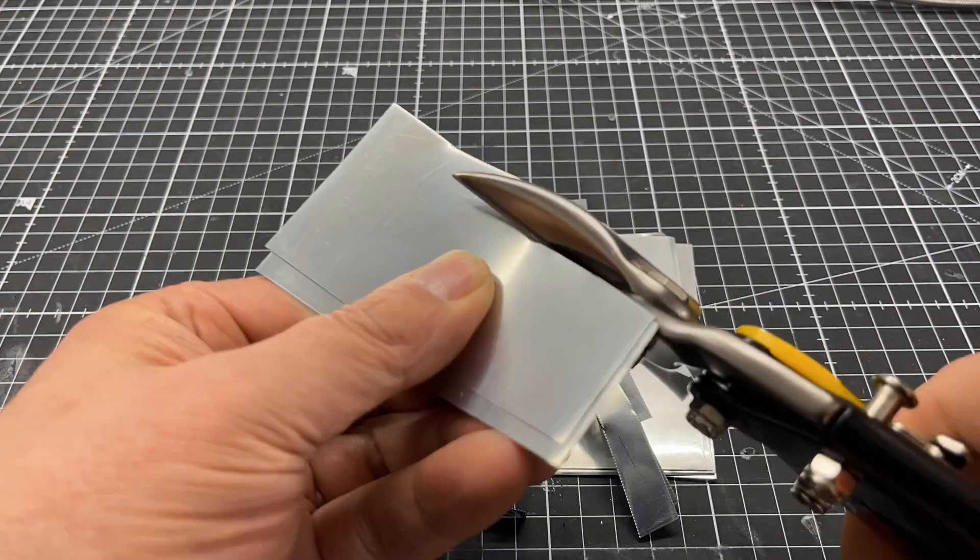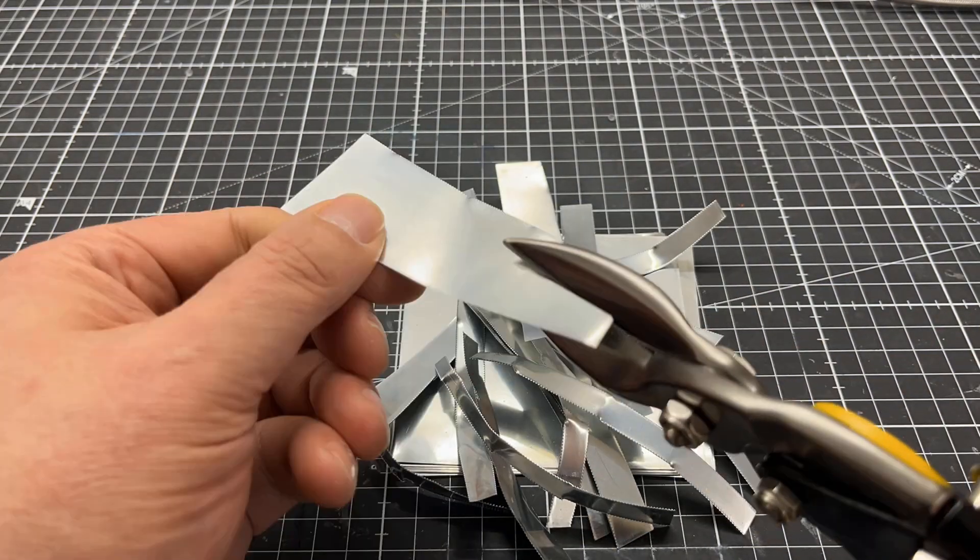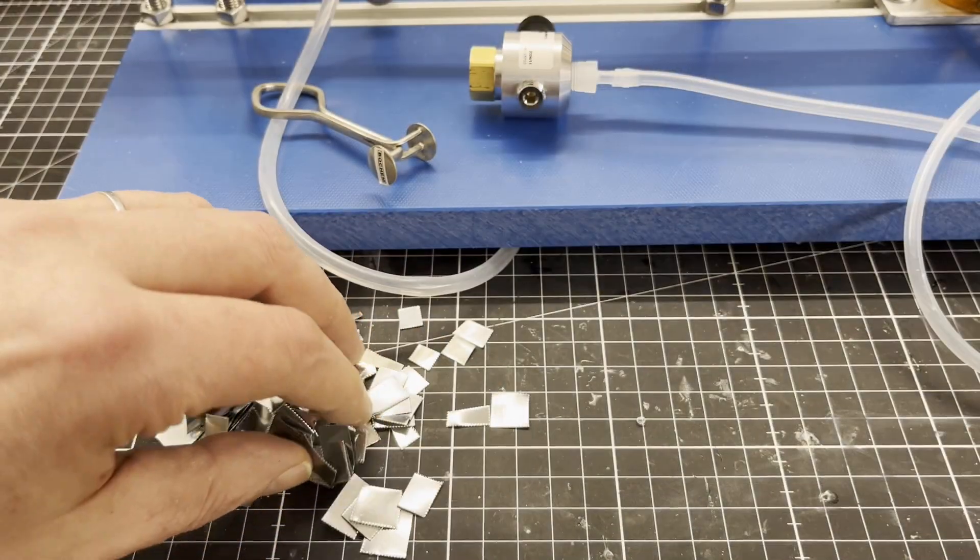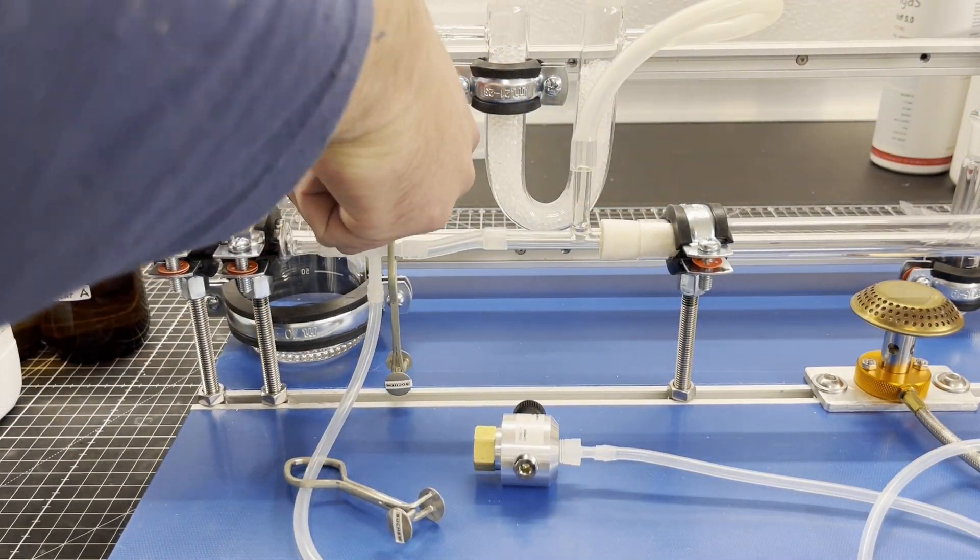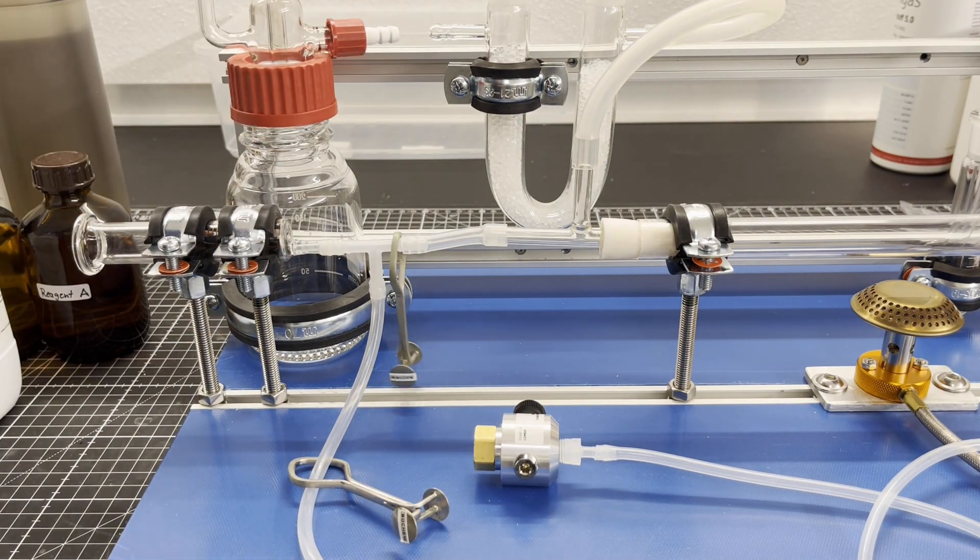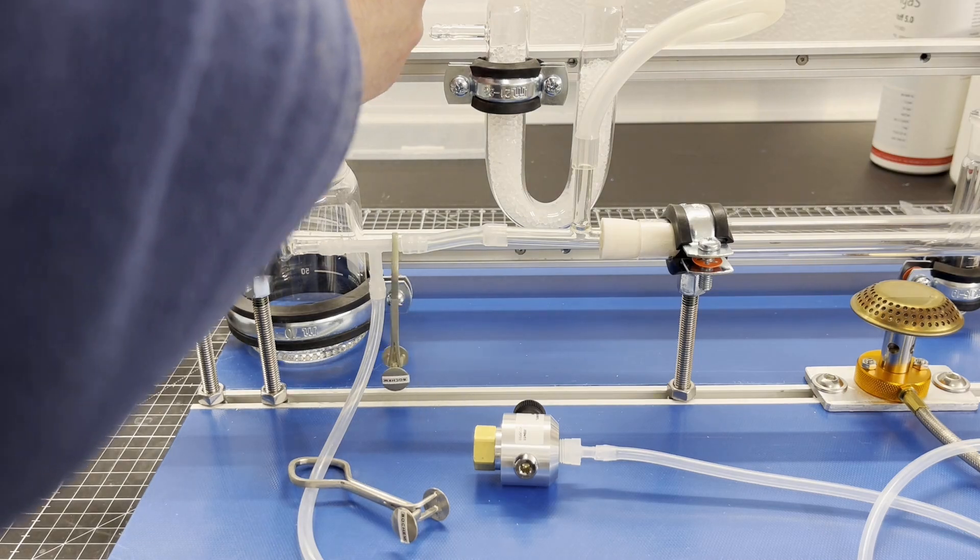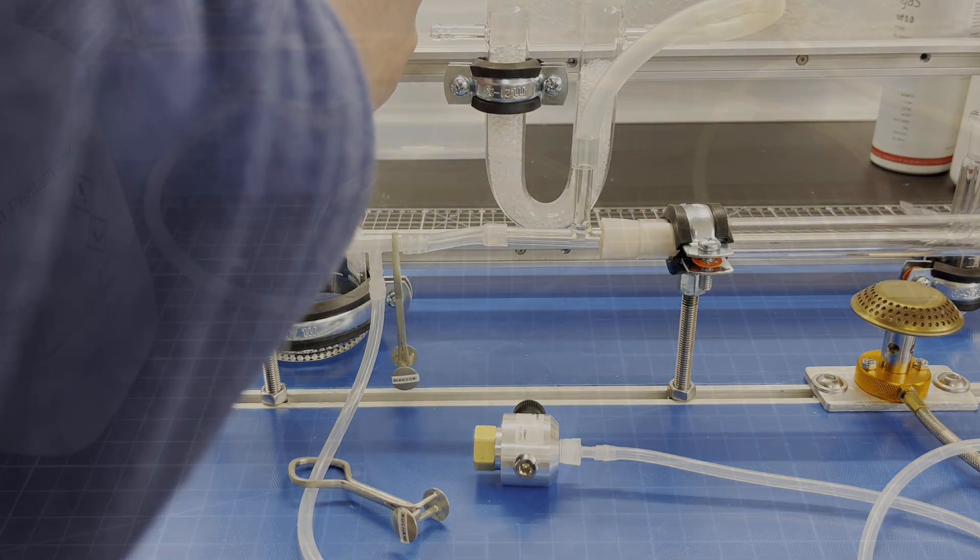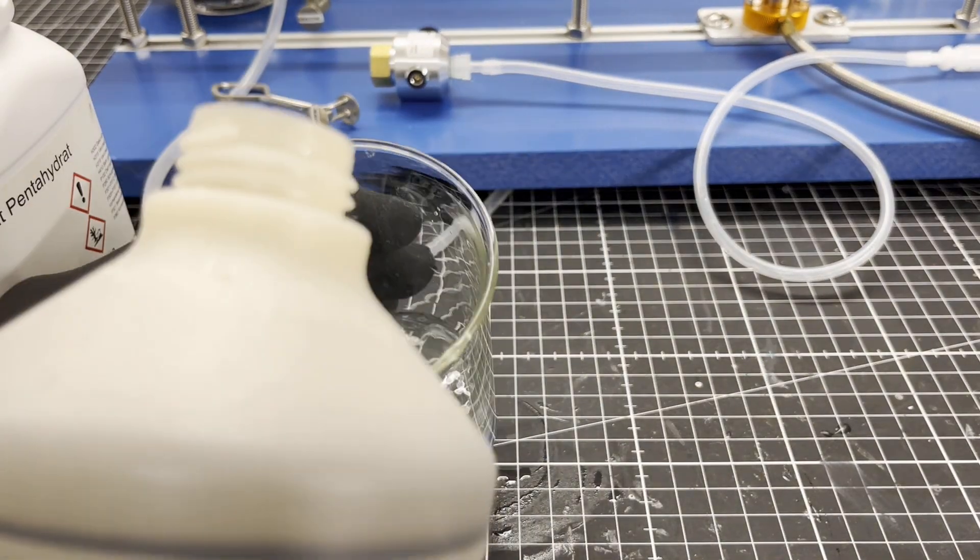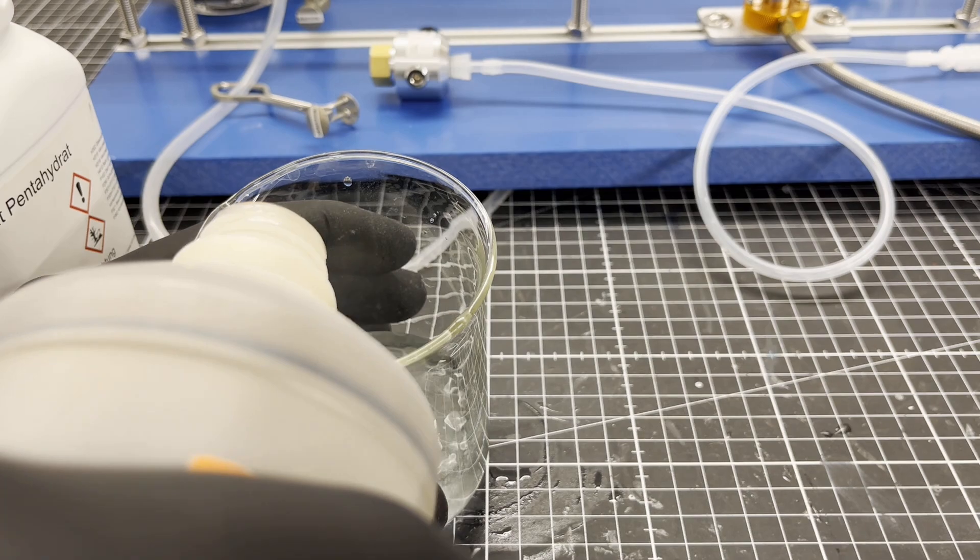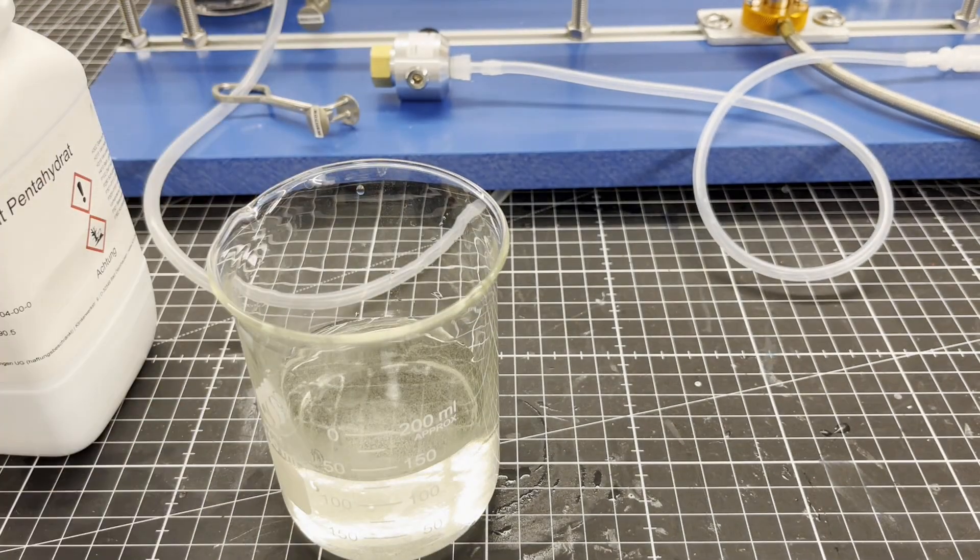About 50 grams of chopped zinc sheet is required to produce the necessary hydrogen. You also need about 50% sulfuric acid. A little copper sulfate is dissolved in it, which accelerates the hydrogen production.